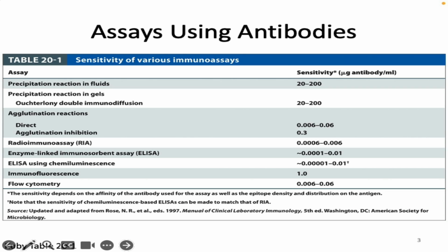Just to give you some examples, you guys have talked about Western blots in Bio 250, where you've taken protein samples, you've separated them on a gel, and then you've used an antibody to find a protein of interest out of all of the proteins that were in the whole cell. I have such pretty slides of this that apparently I didn't feel the need to put in this presentation.